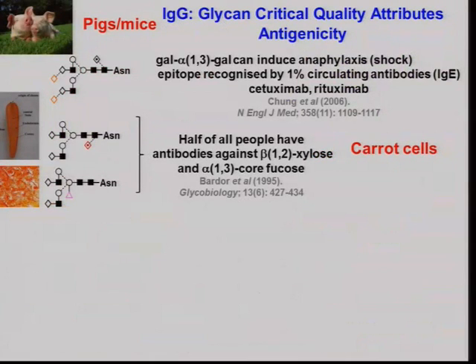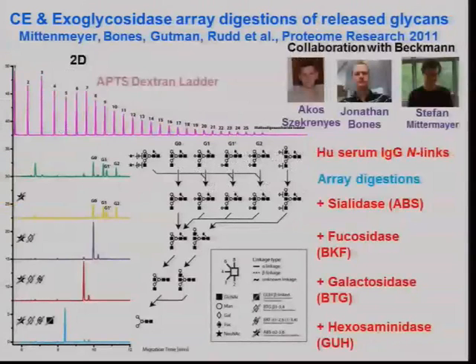Yes? So the specificity of the exoglycosidases is improved. I mean, it's not how endonucleases... Oh no! They're pretty specific, but you have to use them under the right conditions to be sure, because they will sometimes take a second linkage. They may much prefer to take a 4-linked galactose, but if you press them, and you have high enough concentration, they will eventually take a 3-linked. So you have to use them with some sort of understanding of how enzymes work.